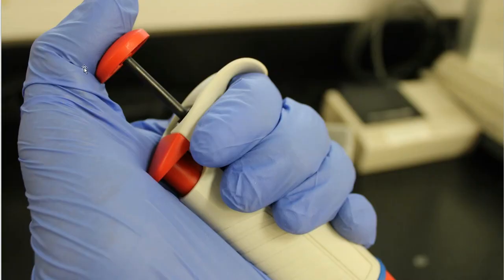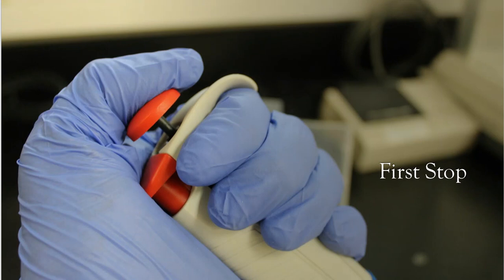All right, so I'm going to put my thumb up on the plunger. This is the proper way that you hold a micropipetter. So that little curvature piece up there nestles perfectly on your finger. It's like a little hanger, and it hangs off of your finger just like your clothes hang off of your hangers in your closet. At least I hope you hang up your clothes and not just trash them all on the floor. So I'm going to push that down to the very first stop. That's the first point of resistance.